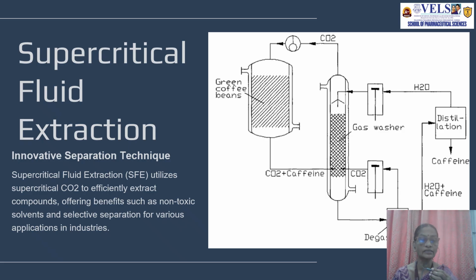Mostly carbon dioxide is used here because carbon dioxide is chemically inert. It is easily available, recovery is easy, and it gives efficient, less expensive extraction. It offers benefits such as non-toxic solvents and selective separation for various applications in industry.